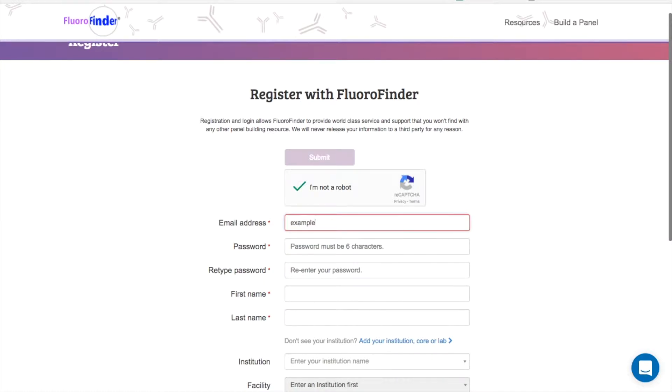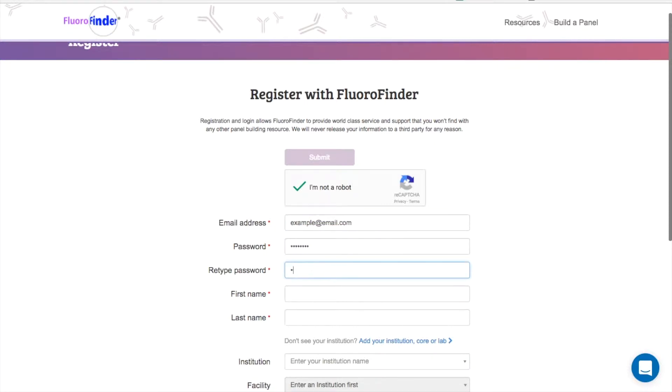If you haven't done so already, go ahead and create an account. This will allow you to follow along and practice building a panel without interruption.